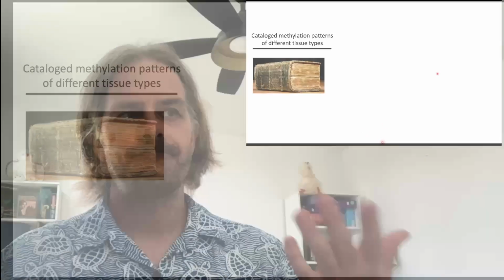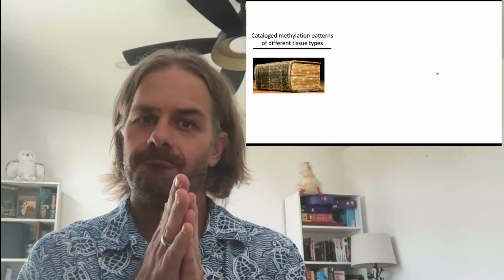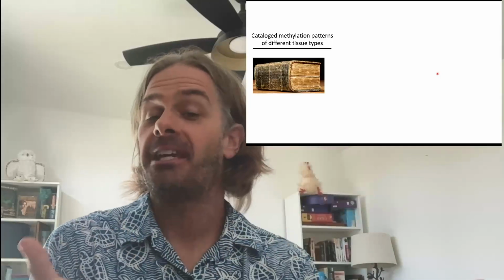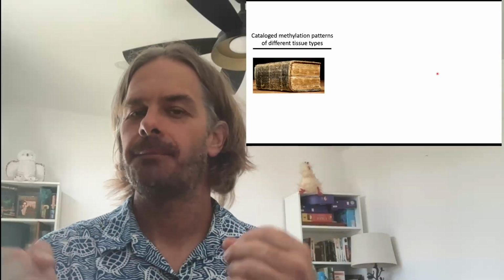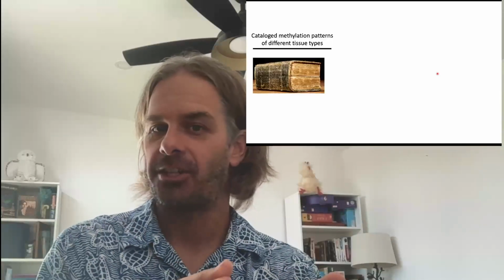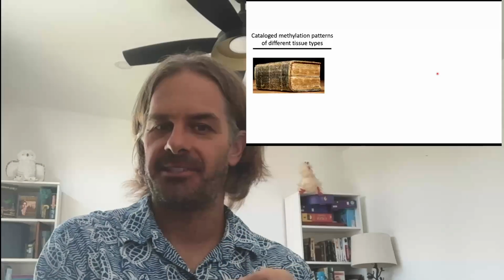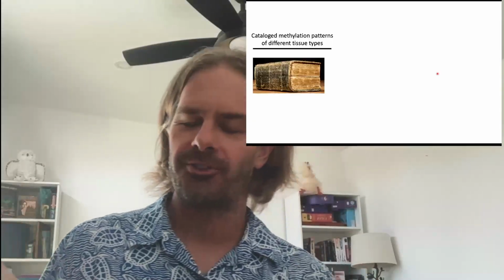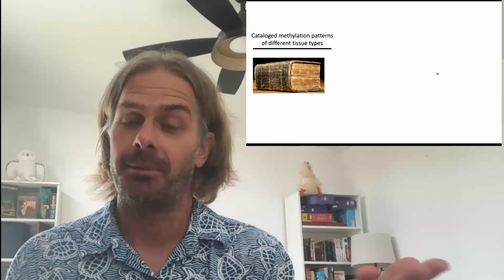So this is an interesting result, and it's very cool to see that cell-free DNA fragment ends are distinct from sheared longer DNAs, and this end difference is due purely to the biology of how these cell-free DNA molecules are produced in the cell and then in the blood plasma itself.